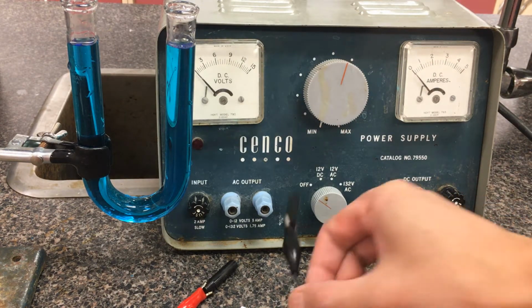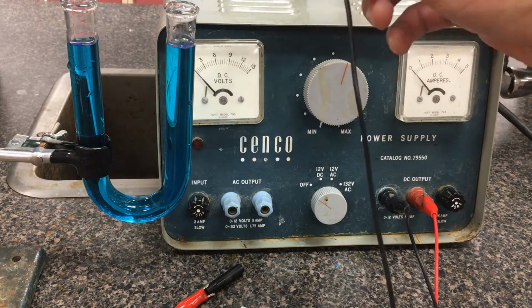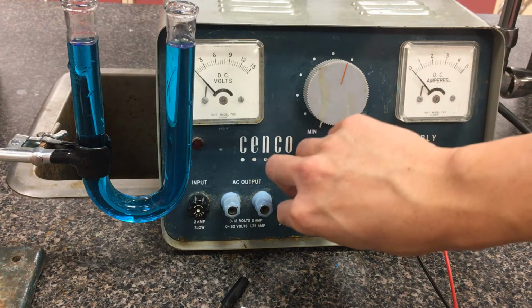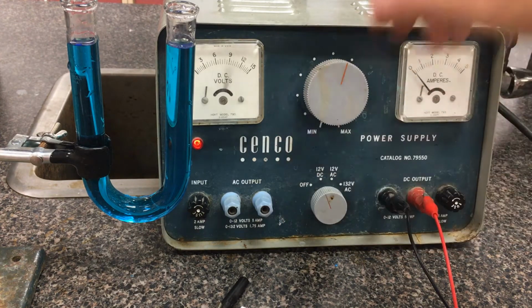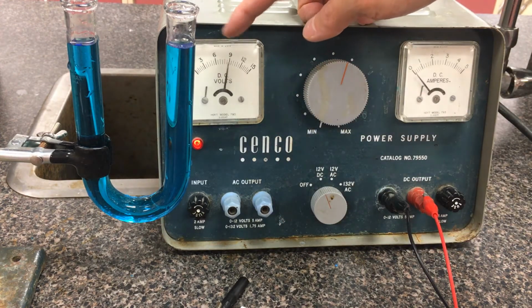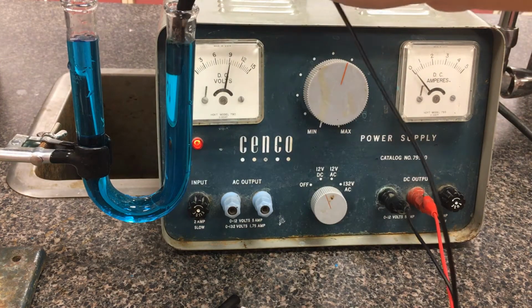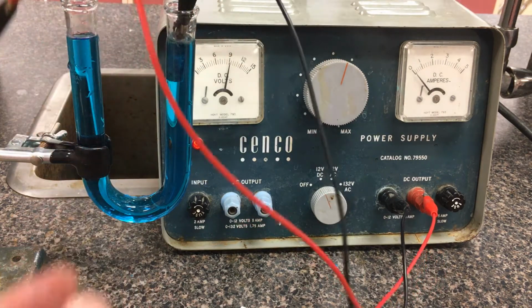Both of them are connected via alligator clips. We're just going to drop the electrodes in once I've turned this on, and then we're going to make some observations of what happens. So I'm going to crank up the voltage. We have a voltmeter on this side, so we can see what voltage we're sending in. I'm going to drop in one electrode on the one side, and the other electrode on the far side.